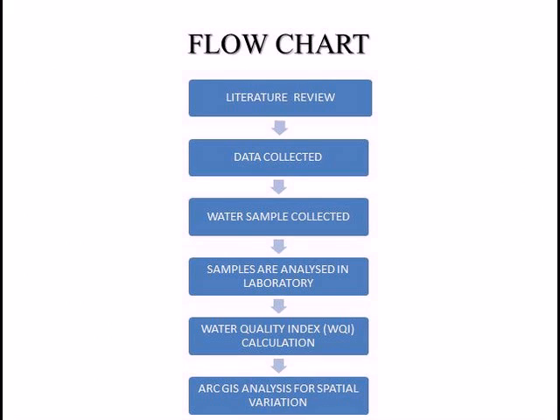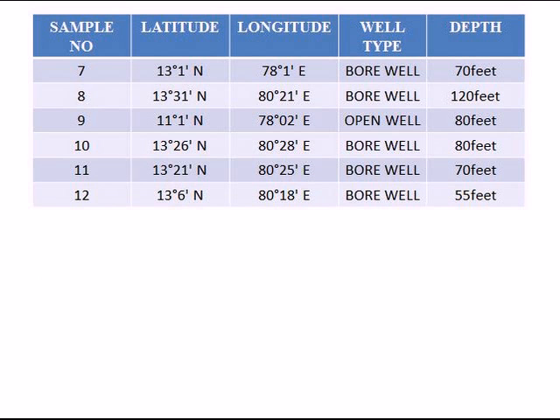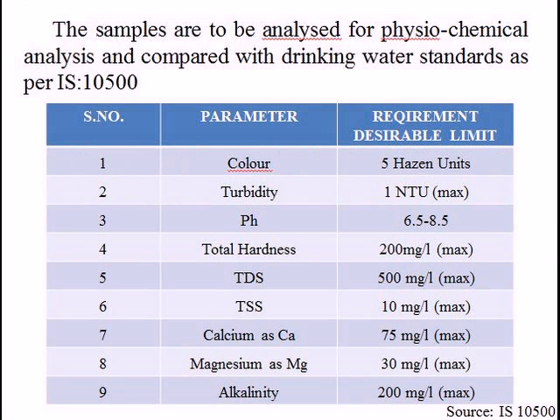For lakes, rivers and dams, the water should be collected near the offshore point. The water should then be filled completely in a container without leaving any airspace. Next, place the inner cap, place a polythene sheet 10 by 10 cm in between the inner and outer caps. Screw the outer cap, place another polythene sheet of the same size over the outer cap and tie the neck with a rubber band. Let's move on to study area.